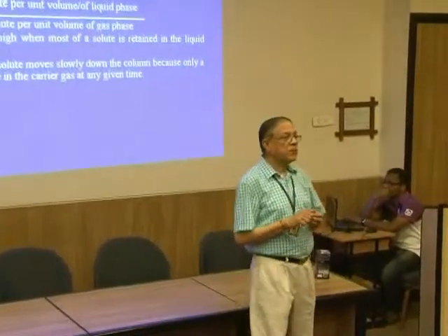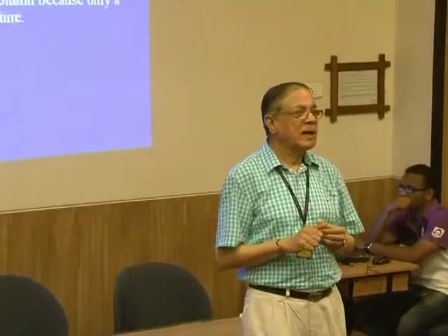So out of these four forces, the hydrogen bonding, the Debye forces, the interactions between two non-polar solutes, and the solubility, out of these four, the first one and the fourth one are the predominant forces responsible for bringing about separation of solutes in gas chromatography.